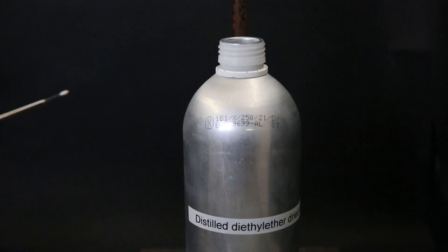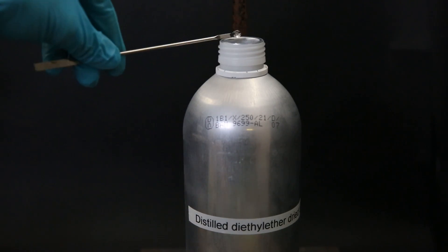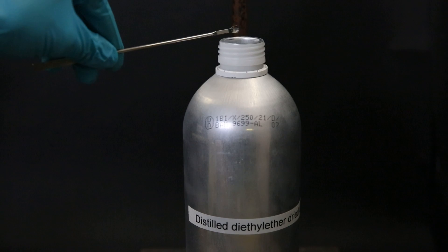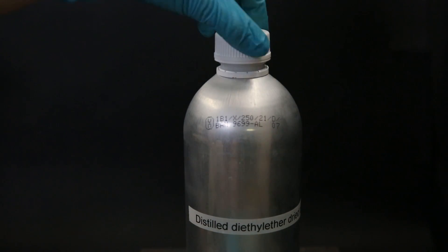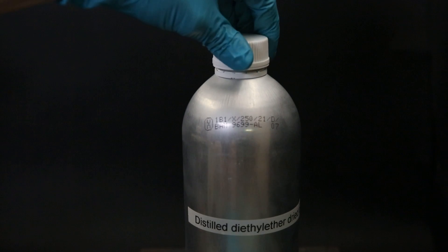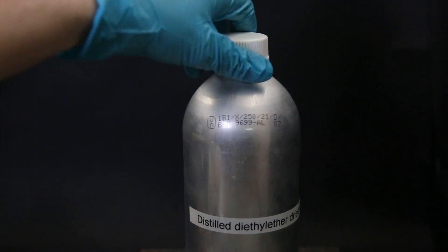I then add a very small scoop of hydroquinone, which acts as an inhibitor to prevent peroxide formation during storage. The recommended inhibitor concentration when using hydroquinone is only 0.002%, which is about 3 mg. Since I don't have an analytical balance, I just put in a very small scoop, which is likely only a few milligrams. Now that it is finished, I can safely store and use my diethyl ether, which I will store in the fridge and use in one of my future videos.